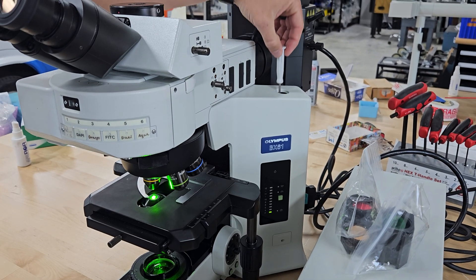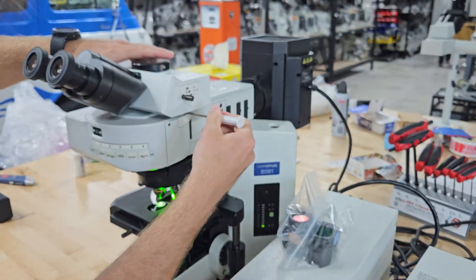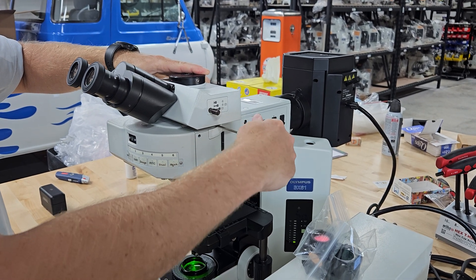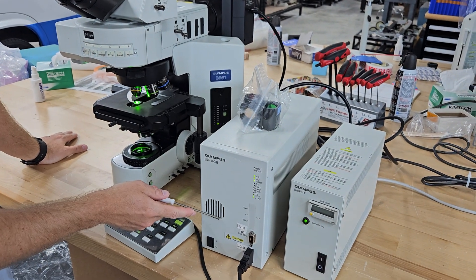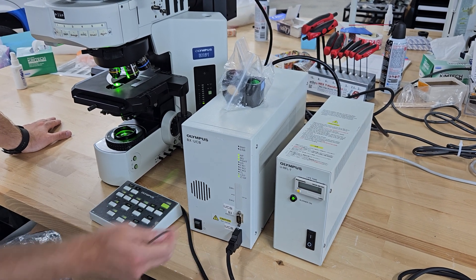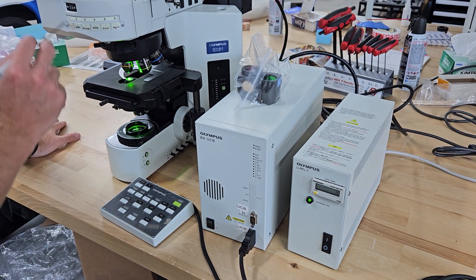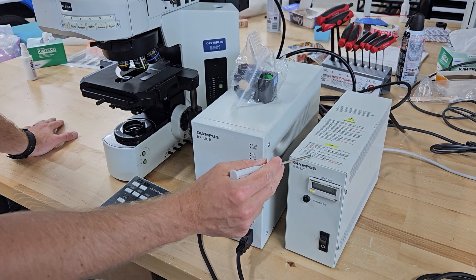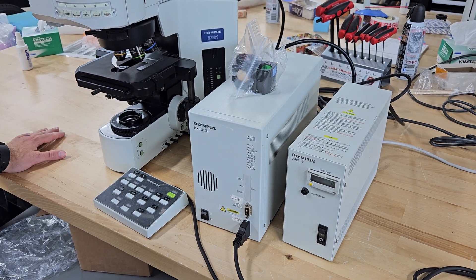You have a three millimeter Allen wrench that you can use to disassemble most things. To take the head off, there's a little slot groove right here — you can take the head off and on. If you're going to unplug any of these cables or anything on the microscope, make sure this UCB system is off, and be safe — unplug it. When you cut these on and off, you want to let them run for at least 15 minutes and cool for 15 minutes. More time is better, but 15 minutes is the minimum.